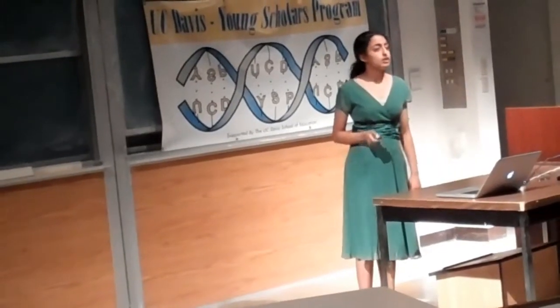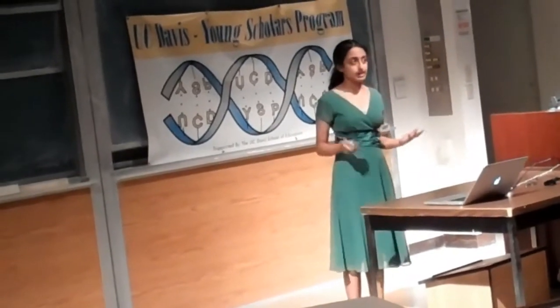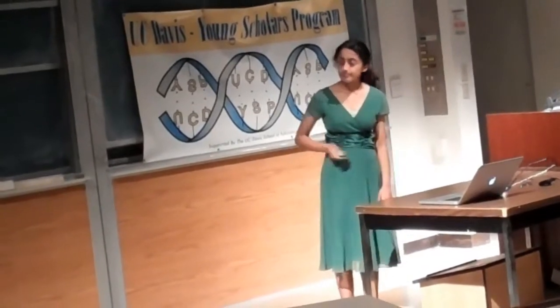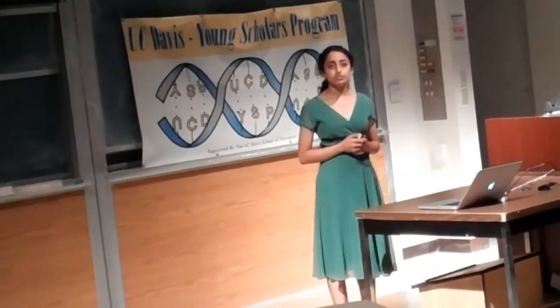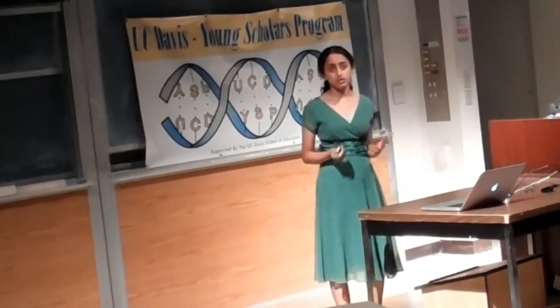In this PCR, Columbia didn't get amplified along with a bunch of the other samples in the first reaction. This led us to have inconclusive data for that line. So here's the table that summarizes the results that we got from our genotyping. In all, we found 5 homozygous mutants, which we will grow to see the effect of the mutation on secondary cell wall biosynthesis.